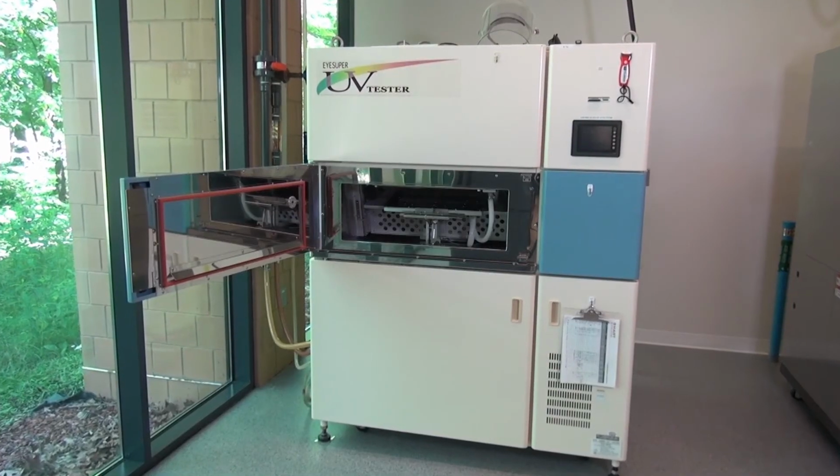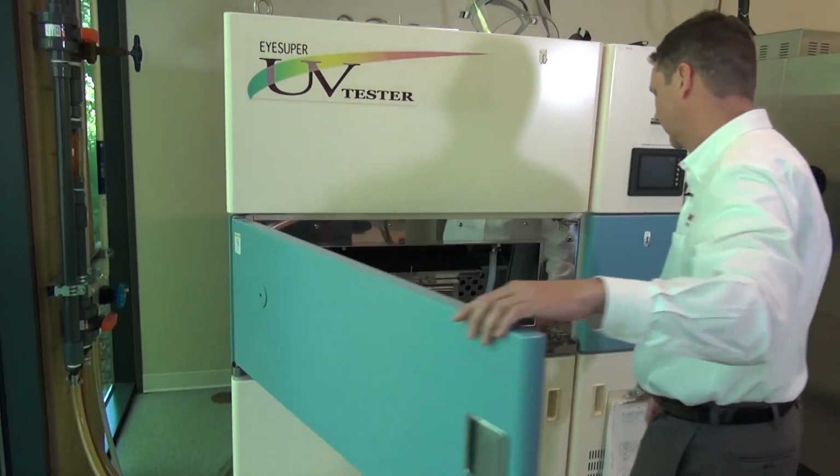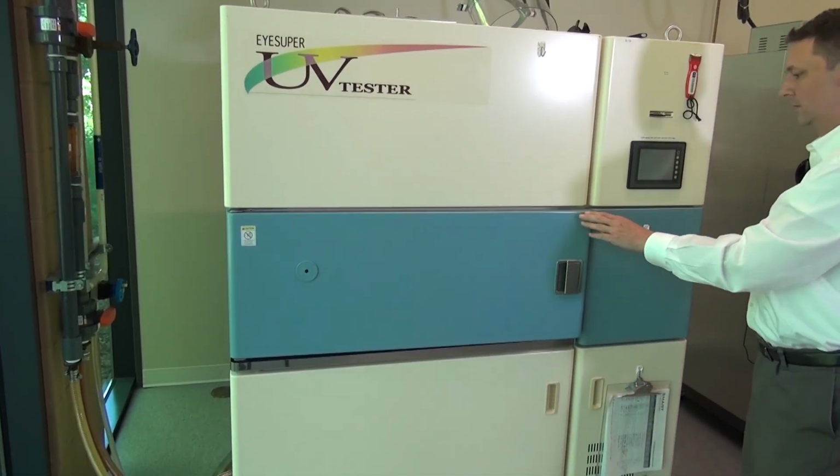Typically, customers come to Smart Microsystems to use the SUV basically because we have the capability. So in the case where they need the test done, or they're working with an experimental material and they want to understand how to correlate the test with some of the other standard tests that are out there. Yeah, of late we've been doing a lot of materials for automotive applications, so sealants and adhesives that are used on automobiles.